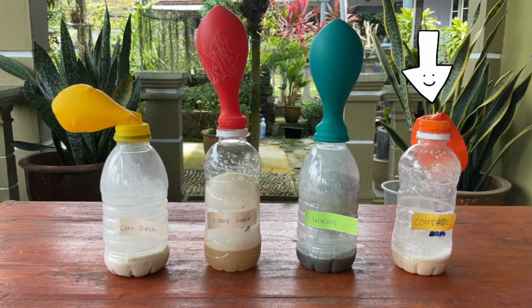The faster the rate of fermentation, the faster the balloon will inflate. The balloons expand as the gas from the yeast fermentation rises. Different types of sugar give different effects on the balloon's inflation. In the bottle that contained yeast without sugar, the yeast did not have food, so the balloon was not inflated.